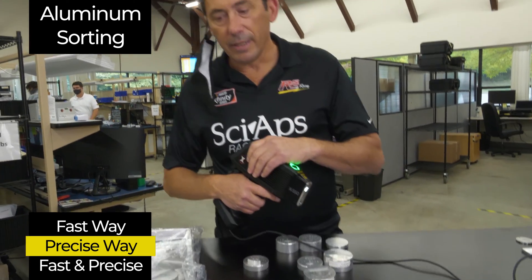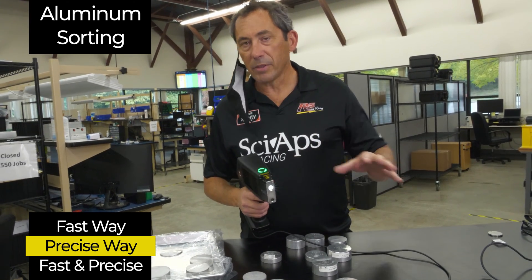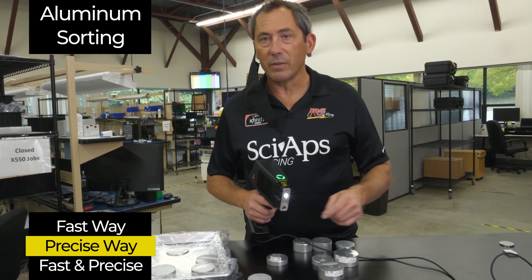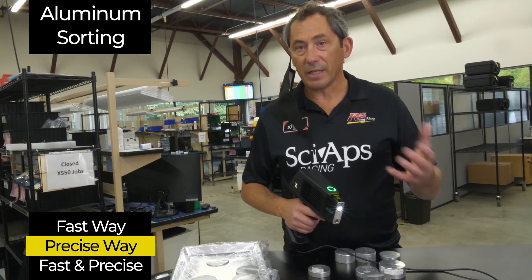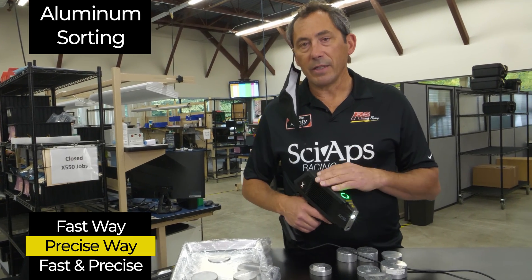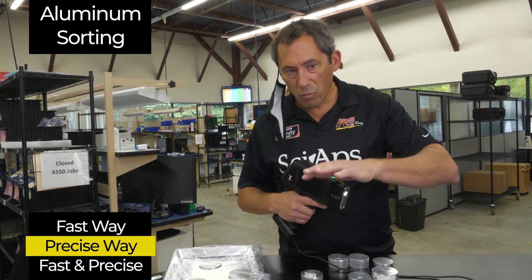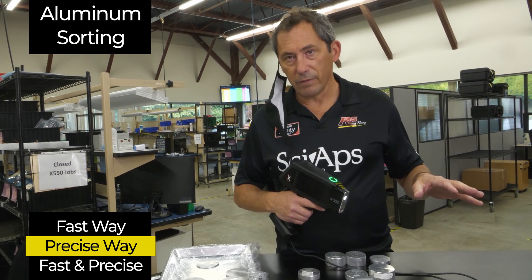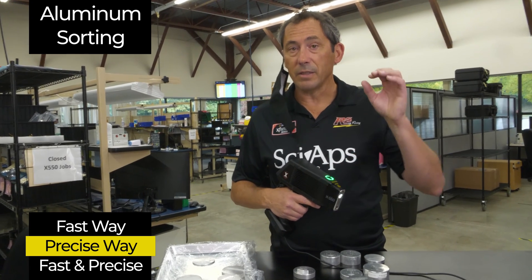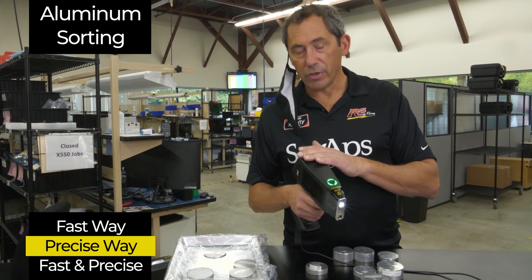What I want to show now is — we talked in the last video — if you get pretty typical types of aluminum, the common stuff: 3003, 6061, 6063, 7050, that kind of stuff, that quick sorting in a single beam shot works great, and we showed that in the last video. Now I want to show what happens if you get a wider variety of aluminum alloys, where you really should measure magnesium and silicon to sort them out the right way and avoid a mix-up. That's what I'm going to show you now.